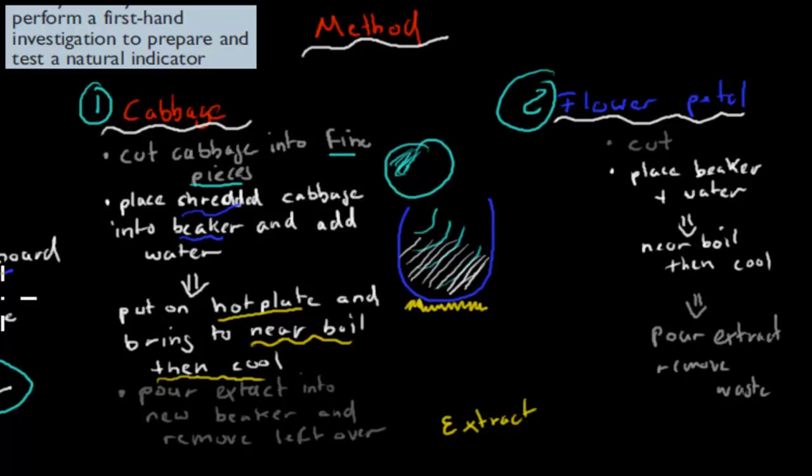We've taken our cabbage, finely diced it, put it into water and into a beaker, boiled that beaker, and then let it cool. Now we have our extract. The solution is what we want. We'll also have some leftovers, some hard stuff we don't want. We get rid of the hard stuff and pour that extract into a new beaker. That new beaker will be our cabbage indicator.